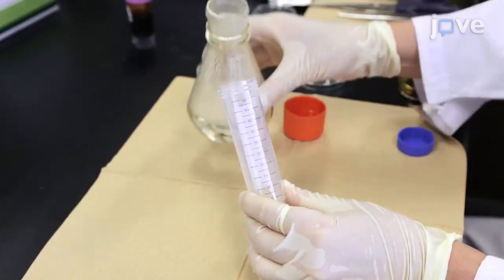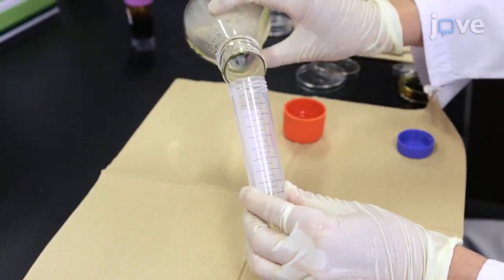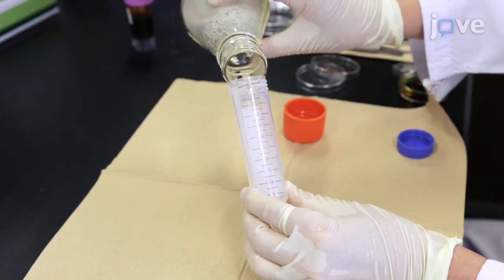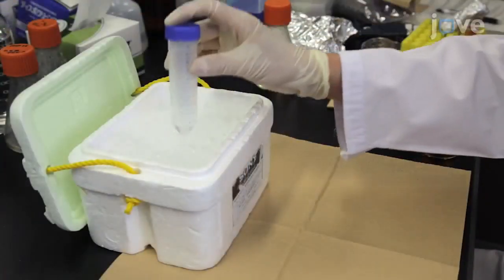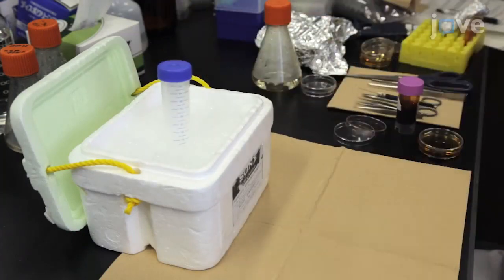In a 50 ml tube, gently pour 5 ml of 0.5% agarose without making bubbles. Place the tube on ice to harden the agarose.